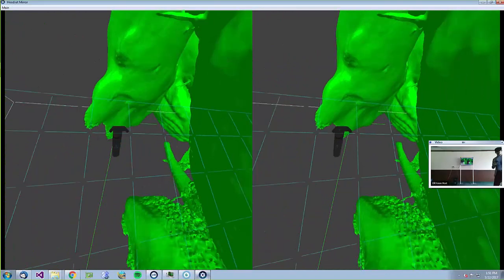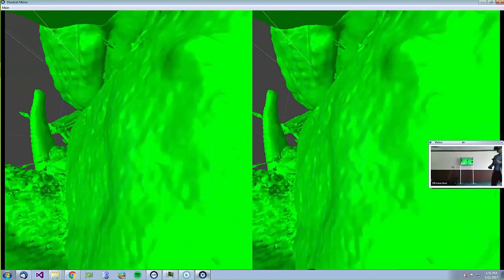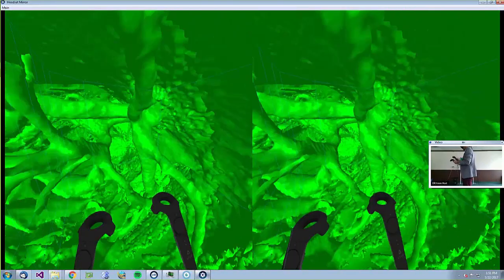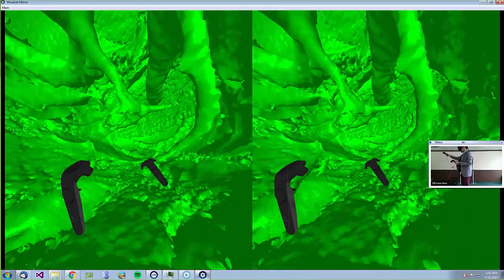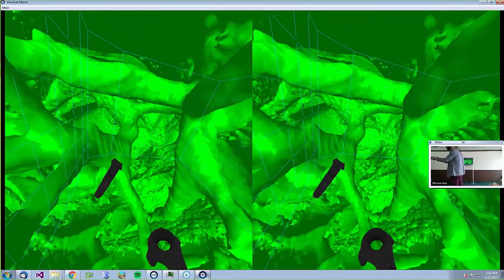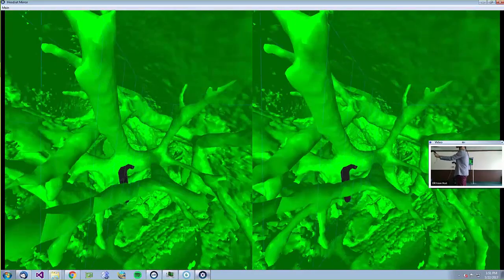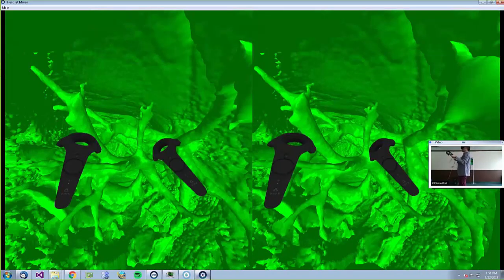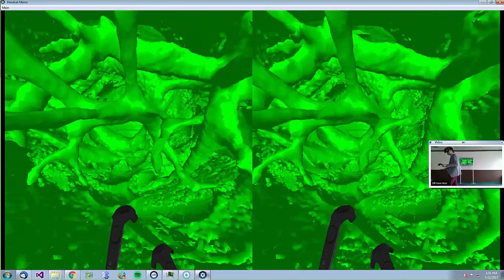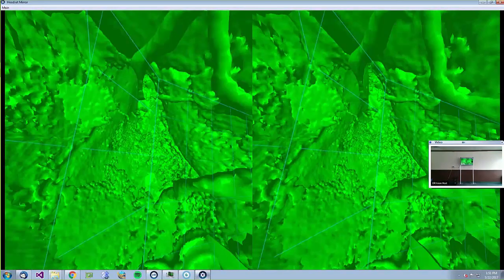That's the hand up there. I'm going to go walk inside. That's kind of the side of his abdomen. And right now, these long structures here, I think they are part of the lung morphology that we can visualize here. So that's this area here. So we are inside the abdomen. That's what we can see. There's some ribs back there that you can also see. And I can walk through and try to find where his head is.